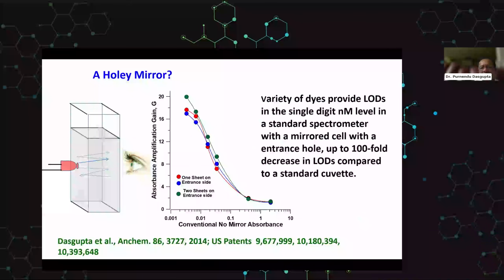So one of the big problems with the cavity detectors is that they're always talking about 99.99% mirrors. That means if you put 10,000 photons in, only one will get in. That means if you put 100 million photons in, 10,000 will get in, and then one will come out. So that's why it's a physical chemistry experiment, that you need a very high power light source and fast detectors.